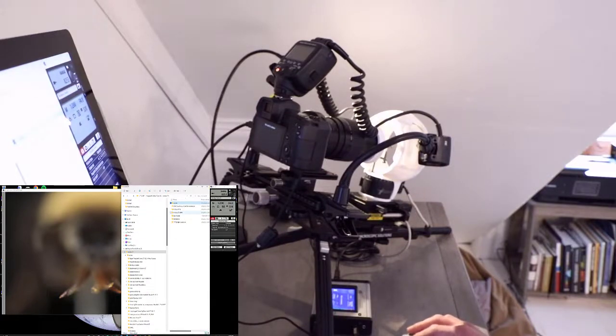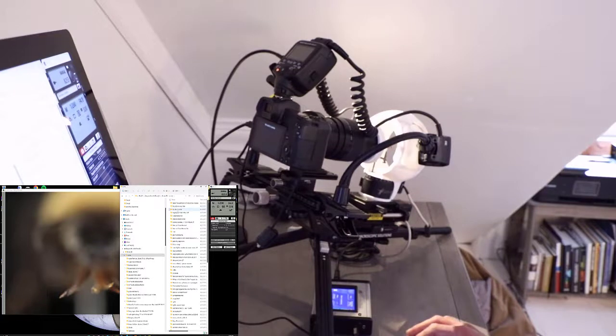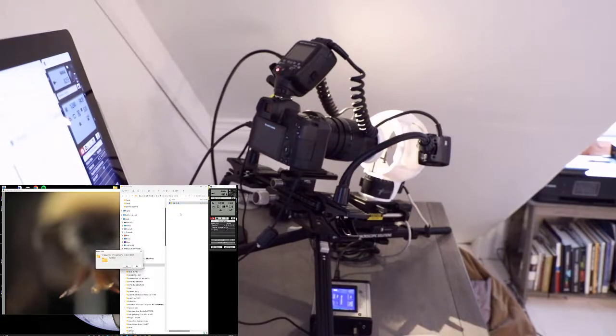Okay, so where I always store all of my images is in a folder on my desktop called Active 2D. In this case, I have it on an external hard drive. So we're going to navigate to the active folder where these images are being stored. Bombus Croce, that's the specimen. I'm just going to delete all my test shots now.